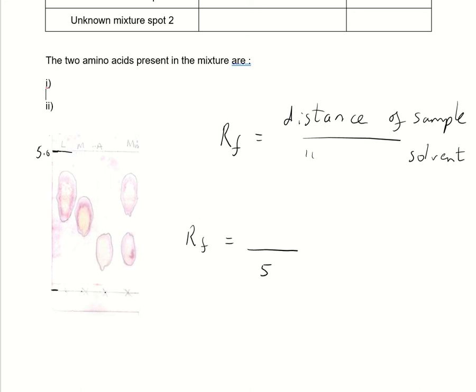Now, for these, as we can see, they are not nice, neat dots. They are actually fairly big smears. Generally, the better it's done, what you want is a few concentrated dots put on this point. But you don't want to hold the glass pipette that you're probably using, the little teat pipette, on there too long.